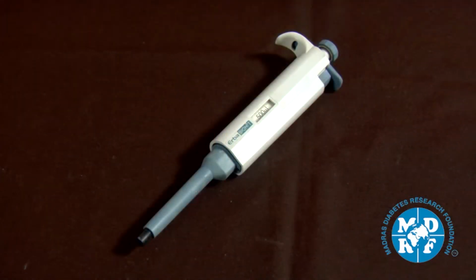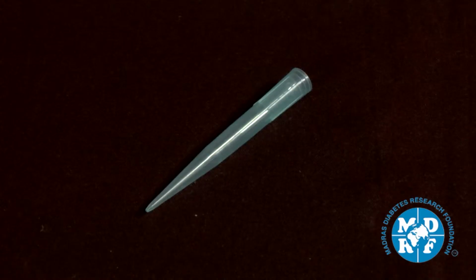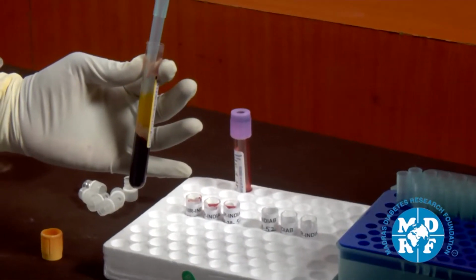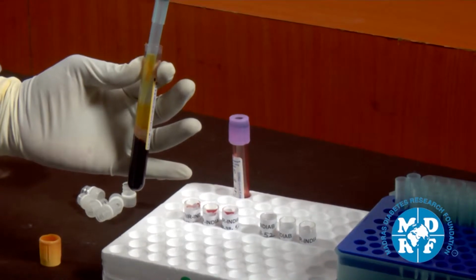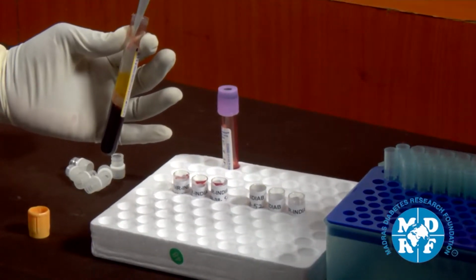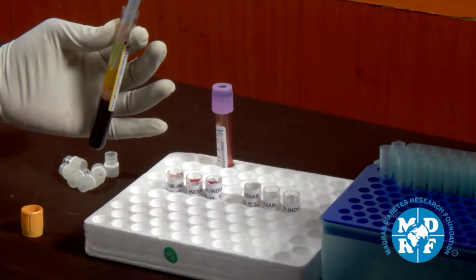This is the micropipette and these are the pipette tips. The micropipette has a fixed volume to draw 0.5 ml. Hence, no adjustment is required and at one time it will draw only 0.5 ml.